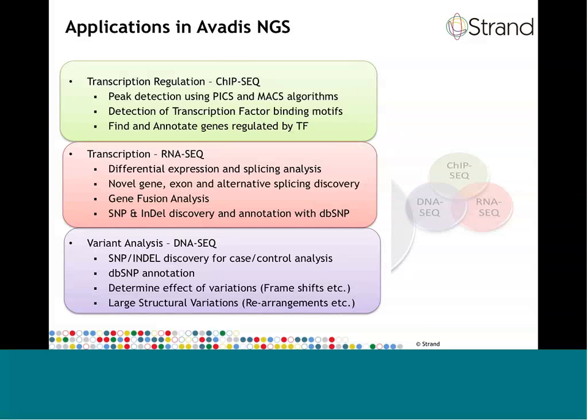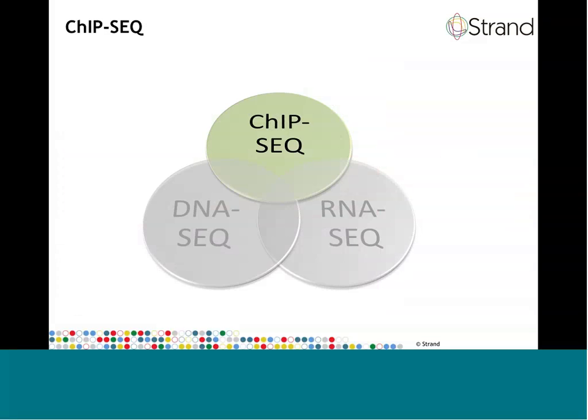So the next set of 7 slides will provide you with some more detail on the ChIP-SEQ workflow of Avadis NGS.